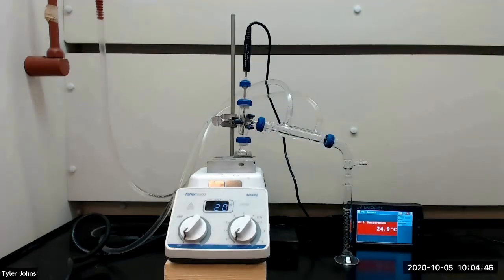We will now begin our simple distillation by turning on the hot plate and heating our unknown liquid mixture in our 10 milliliter round bottom flask until it boils rapidly. We'll then adjust the hot plate so that we collect 1 drop of distillate every 5 seconds.